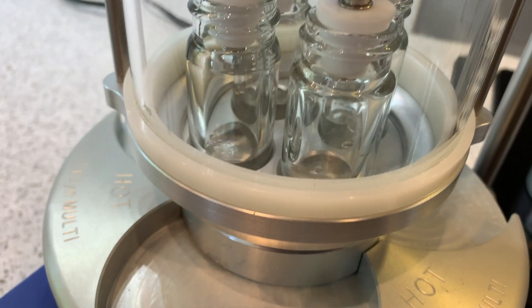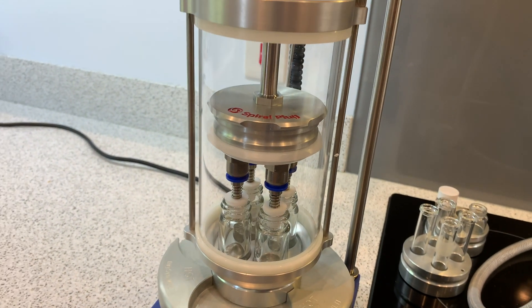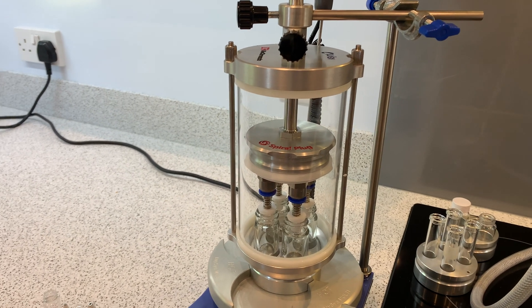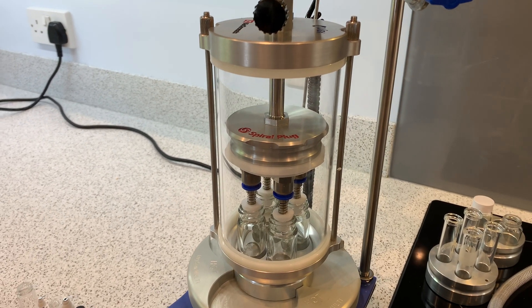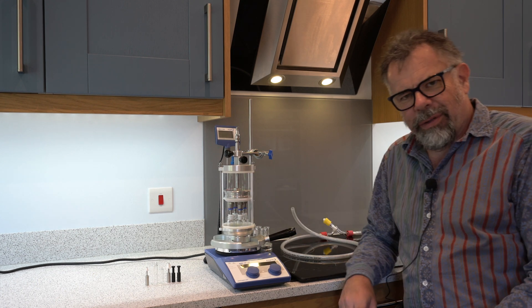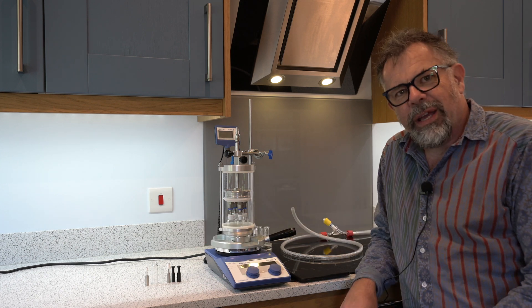Here you can see four tubes being evaporated at the same time. A great thing about the spiral evaporator is there are no moving parts. Let me show you how easy it is to take apart the unit and change the plug fittings as required.